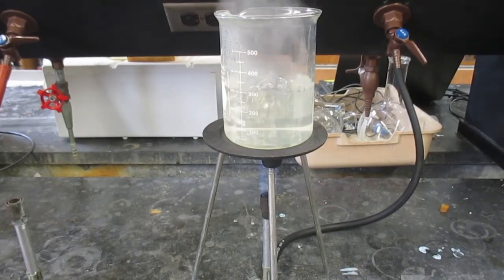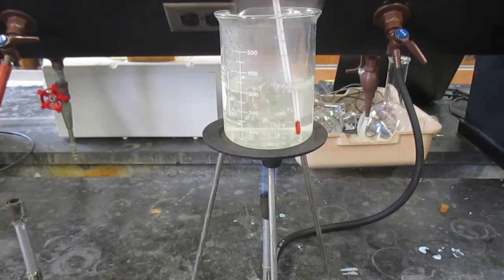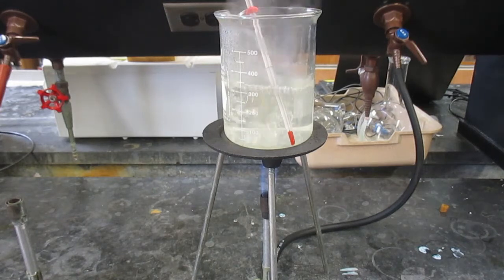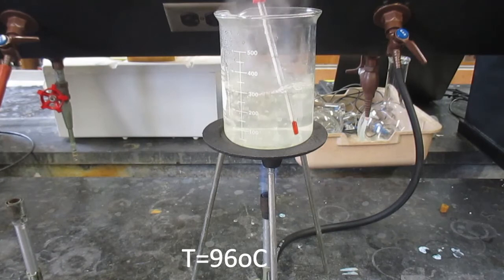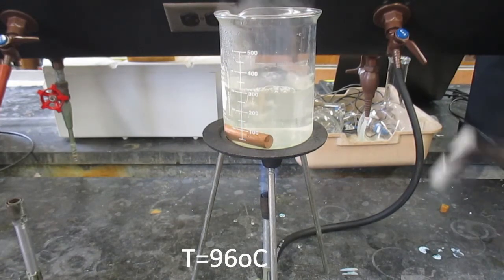This water has been boiling for about ten minutes now and I'm going to record the temperature of the boiling water. The thermometer is taking its time. According to the scale, the temperature of the boiling water is 96 degrees Celsius.